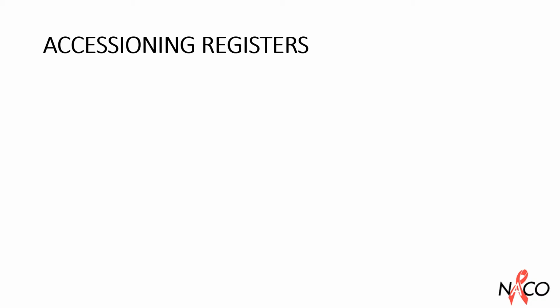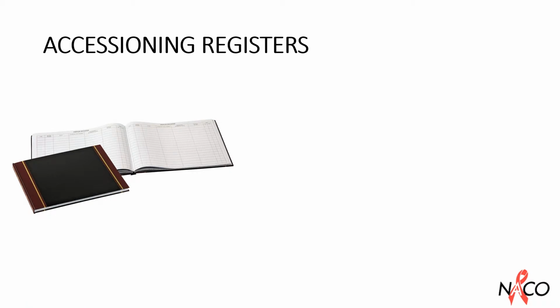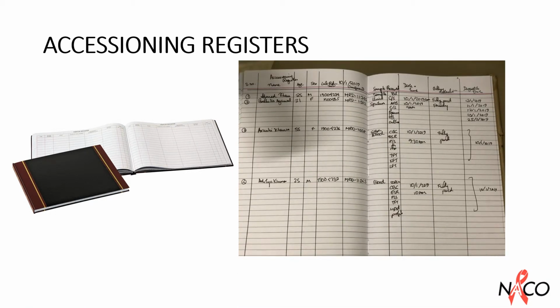In resource limited settings, accessioning can be done by manual entry into registers of the important details required at accessioning.